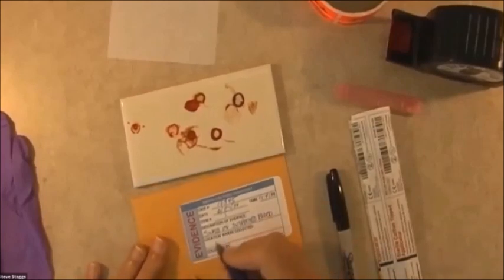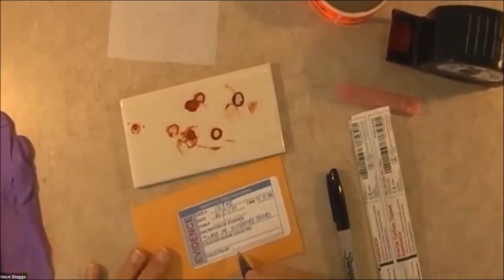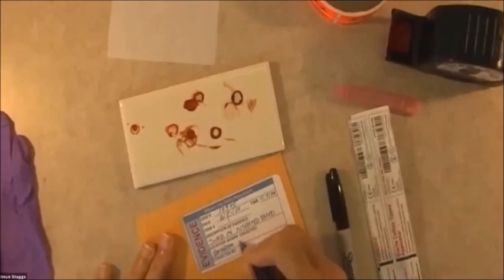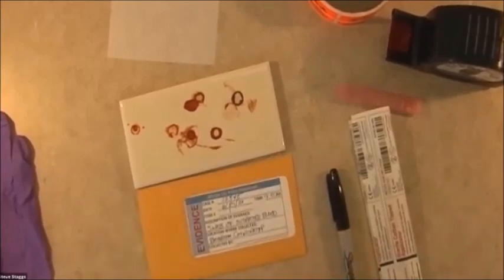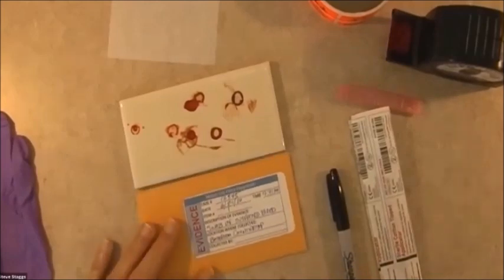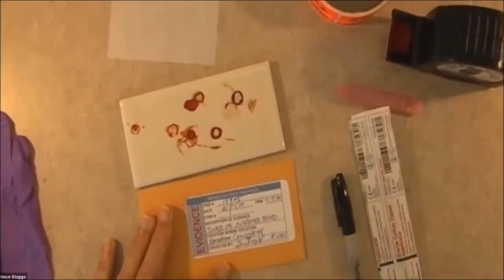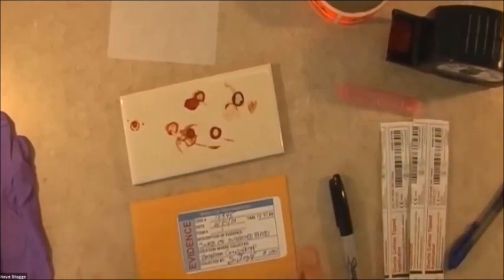Then the location — we've already got on our property report whatever the address is. For the location, we're going to put whatever this surface is, so we're going to put bathroom countertop. There'll be more detail in your notes, in your report, and there'll be photographs showing where it is on the countertop. Then collected by — that's me. So I have gone ahead and filled this out and I am now all ready to do my collection.